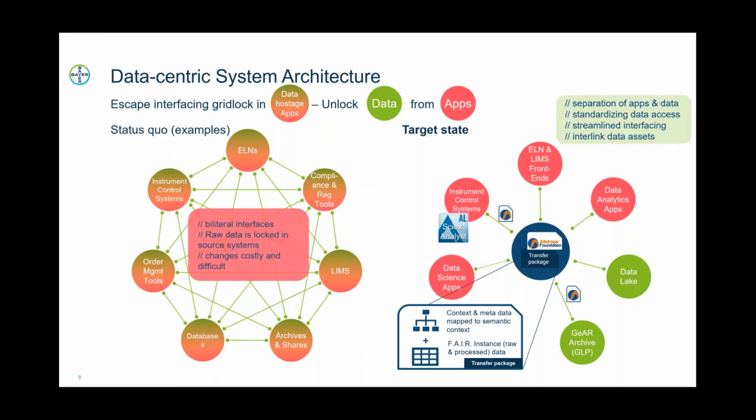And we chose to use the Allotrope Data Format in particular for the instrument data to serve us for this purpose. So from the round trip, it helps us bring data into an archive, but also, as we showed earlier this year, we already have a productive LIMS interface with SCIEX Analyst in place, which serves the need to transfer data from one system to the other, so that we are able to separate data from applications. And with that, I'd like to hand it back to Blair to show us the newest developments and where we are at.